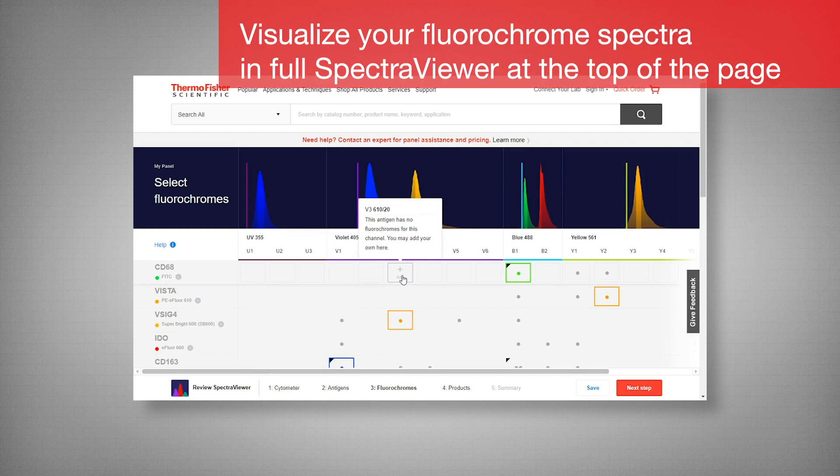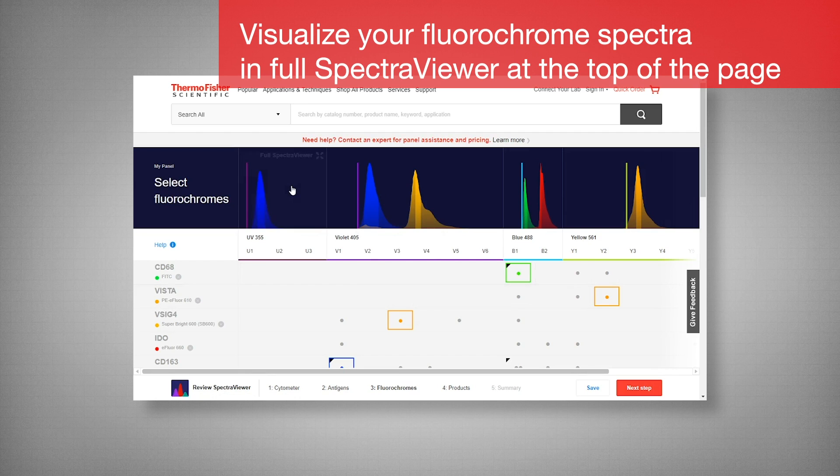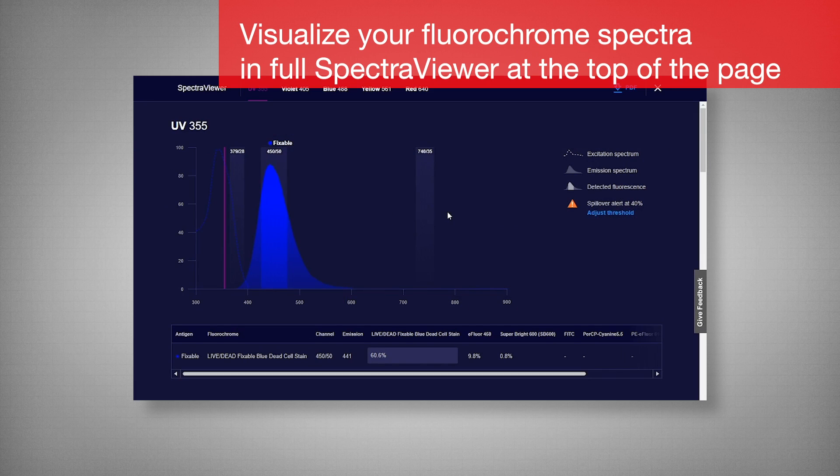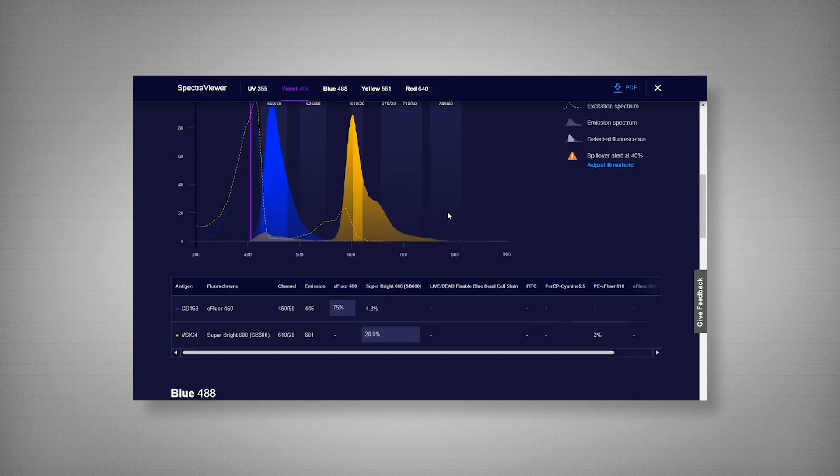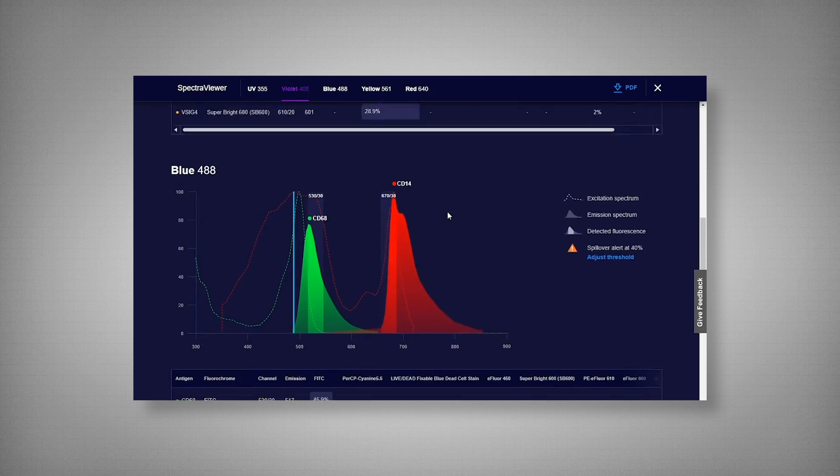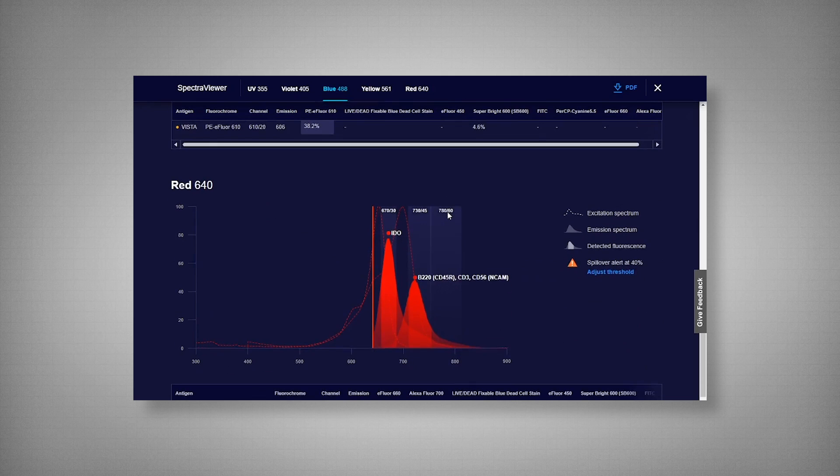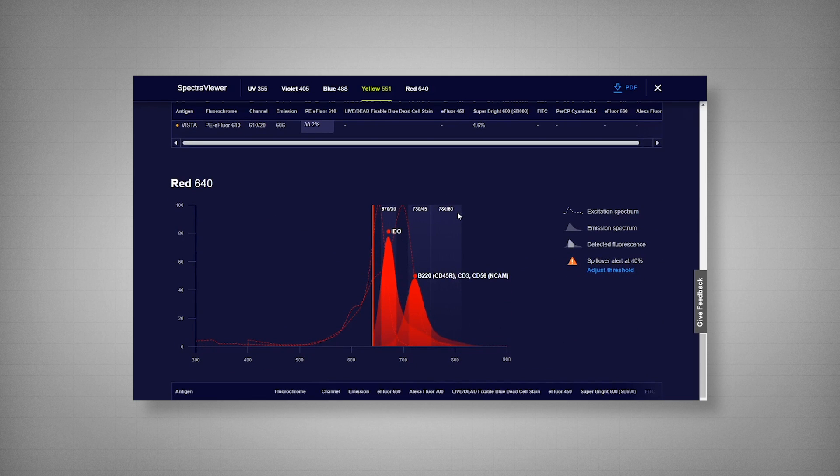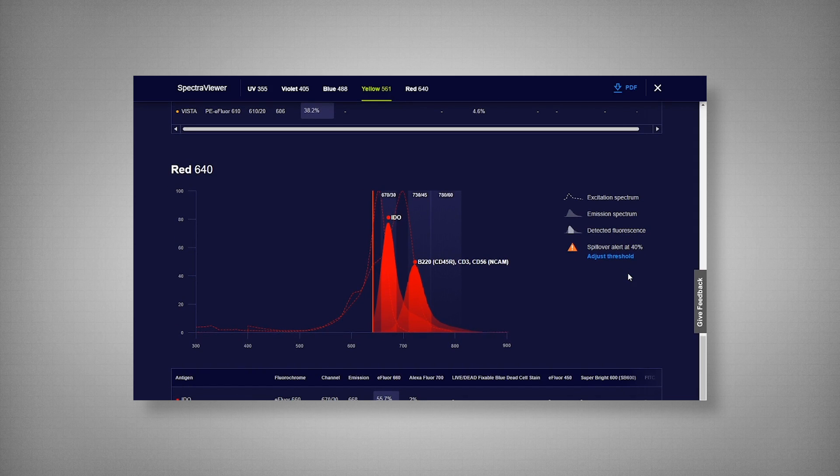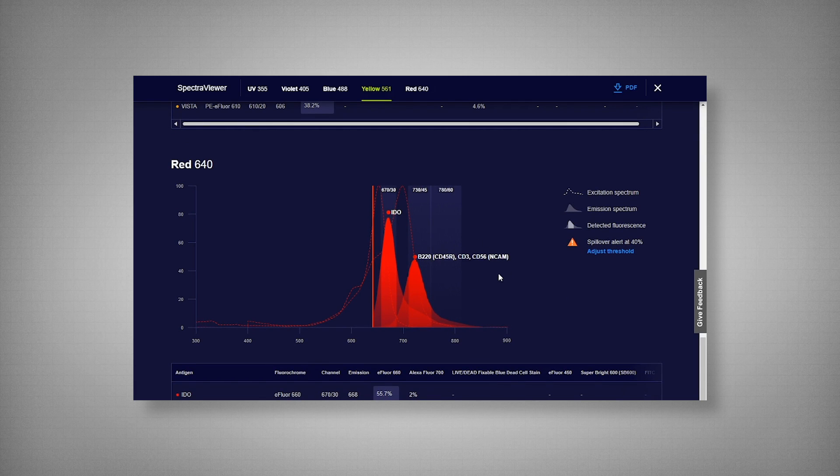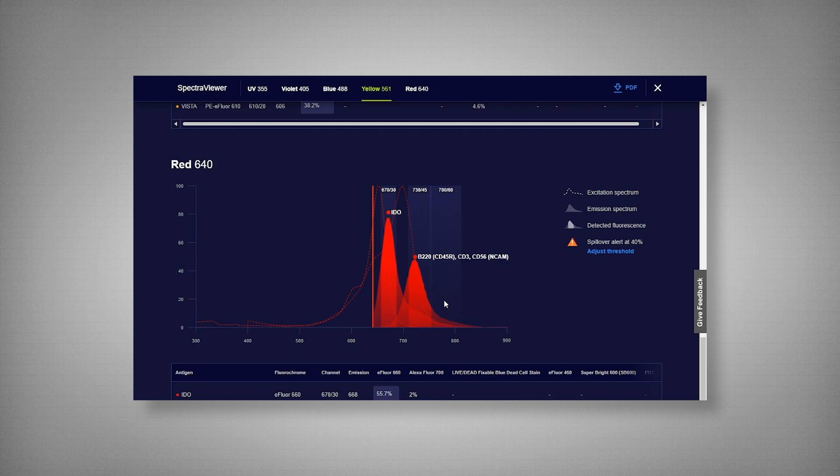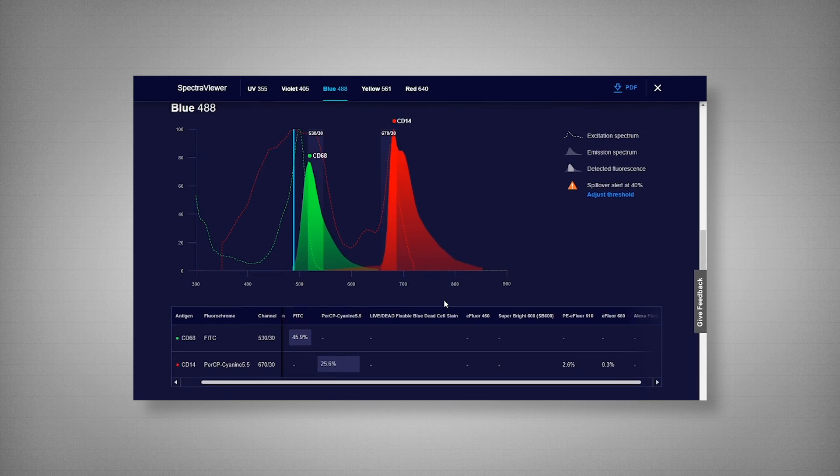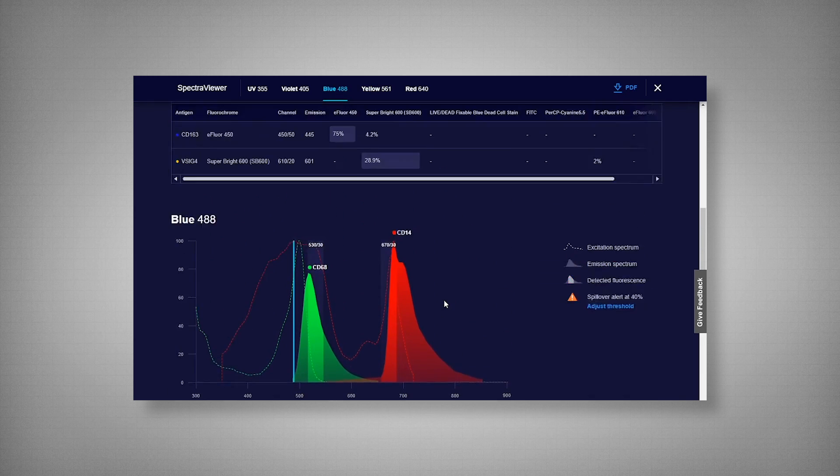Now with the spectra viewer, you can also set it to full screen mode, and it's adjusted by each individual laser. So you can see we have our UV, our violet, our blue, yellow, and red. Now you can adjust your spillover threshold if needed. Now here we can see in our red laser that we do have some spectral overlap between our IDO and our dump channel markers. Now because IDO and our three markers in the dump channel, these are mutually exclusive, so it's a bit more forgiving. But overall we have great separation between our co-expressing markers.